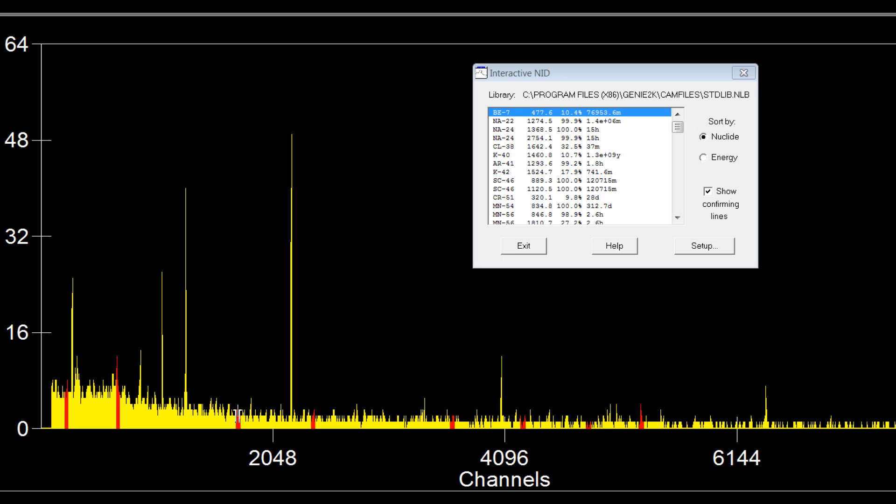So this is a swipe from a car when it has been raining. Quite a dirty car actually. You can see all these nice little peaks from potassium-40 and these radon daughters that we talked about before, as they were washed out during the rain.